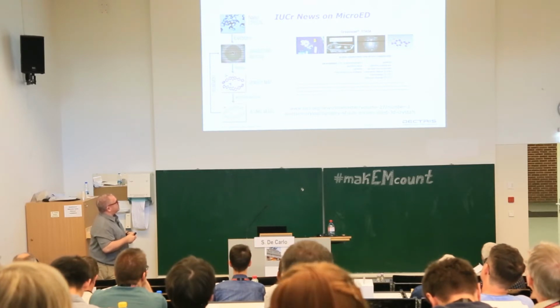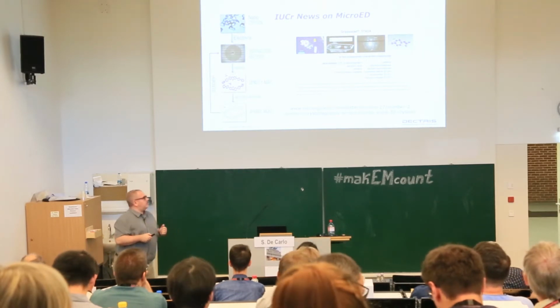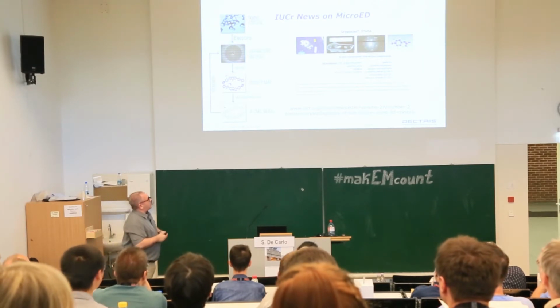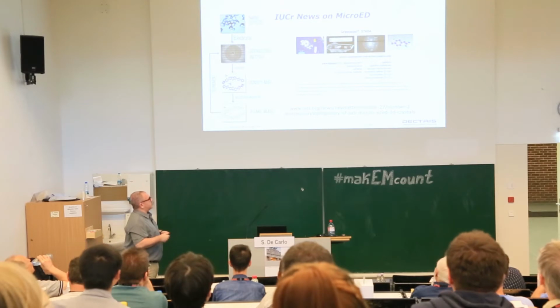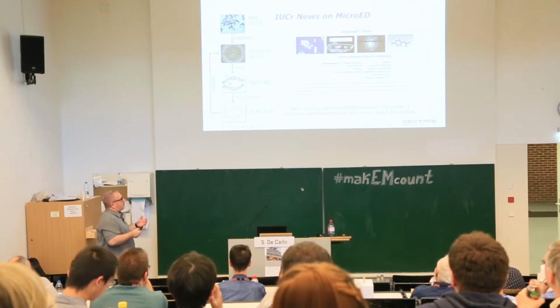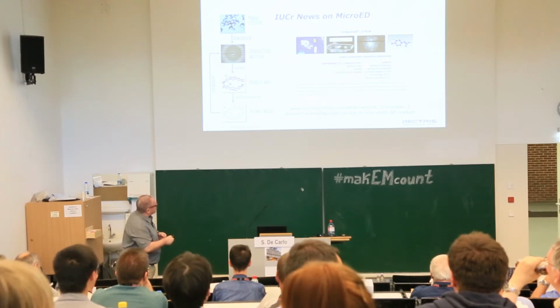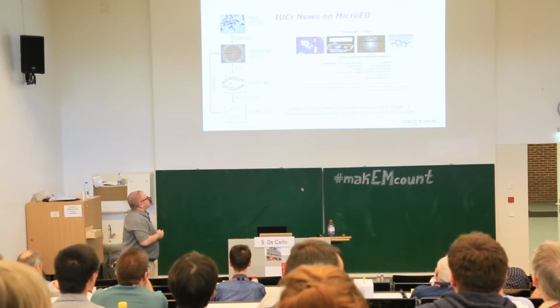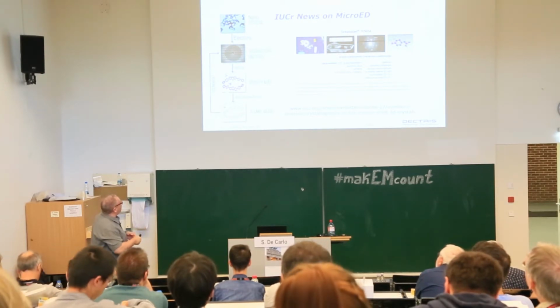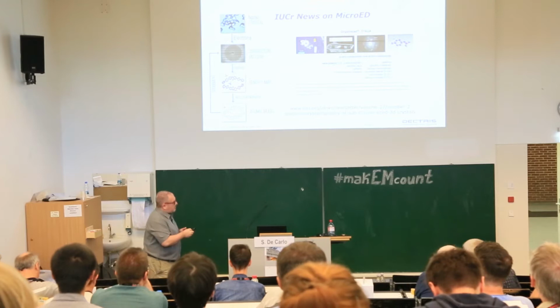But here the interesting part is that you can bring single crystals, which are too small to be analyzed with synchrotron radiation, inside the electron microscope, and with a quick workflow you get to solve the structure of single crystals. In this case it's paracetamol, a drug, so it's interesting for pharma or structural chemistry. These results were published last year by Tim Grüne and his team in Angewandte Chemie, and the idea is that you can really go from the crystal to the atomic model in a very, very fast and straightforward manner.